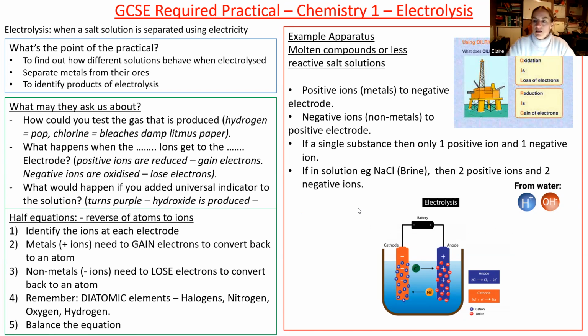So this technique is used for the most reactive metals in your reactivity series, like magnesium, potassium, etc. And we also need to identify products of electrolysis. So that is always the tricky one. I have a nice little summary table of that and how it all works.